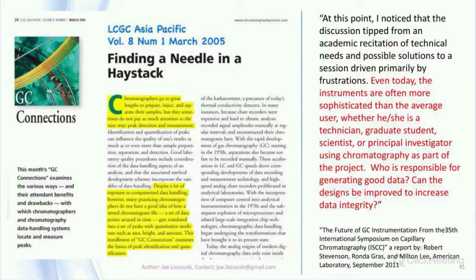A few undergraduate schools I've visited have some instrumentation, but the education about their use is minimal. Given the emphasis on data integrity today and the problems that have been reported in the reproducibility of laboratory data, this is an area that needs significant attention.